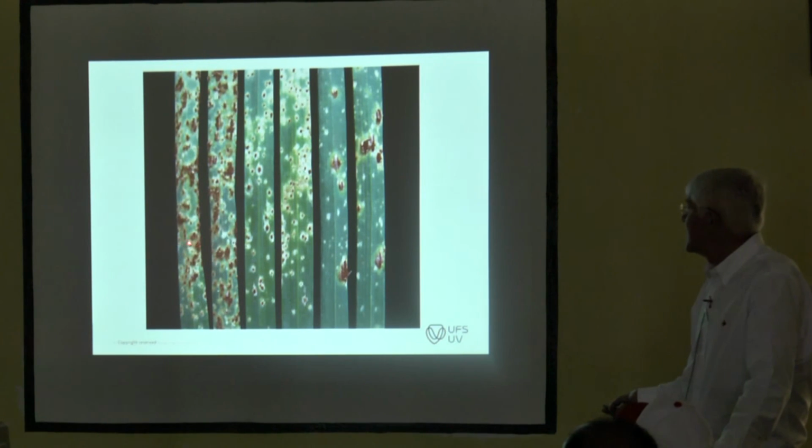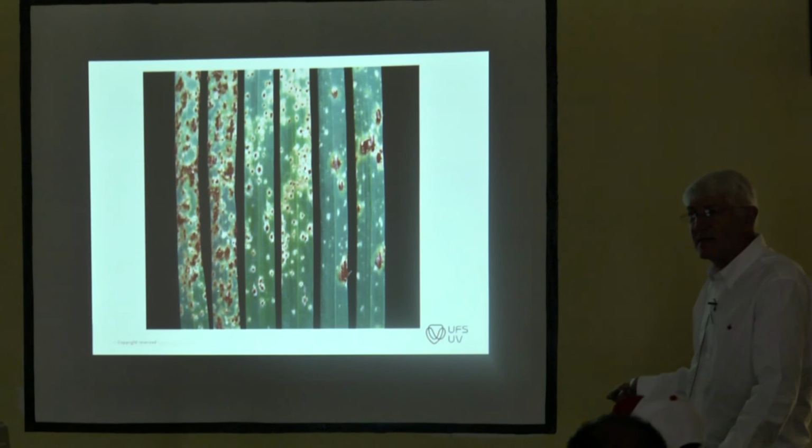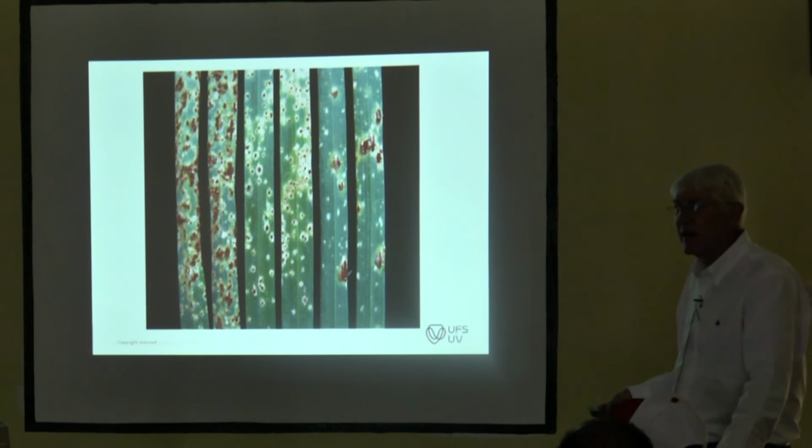So these are not very typical wheat stem rust infection types. That one would probably be not too out of line, but this one, and that's not a mixture of isolates. You get these full susceptible pustules on the same leaf with fleck. So it's X. It's a very interesting response. That was the first time in my career that I actually saw this.